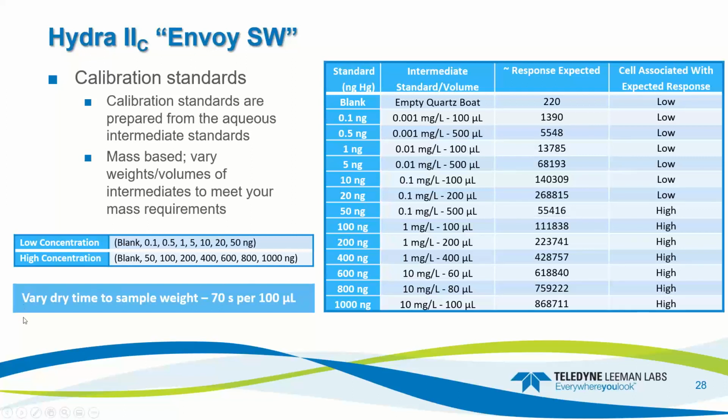We also need to vary the dry time depending on the sample weight. We recommend about 70 seconds per 100 microliters of solution added into the boat. And you can edit that when you make your sequence. So we'll get there shortly.